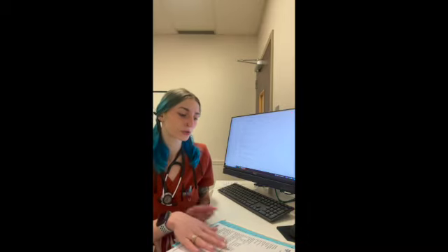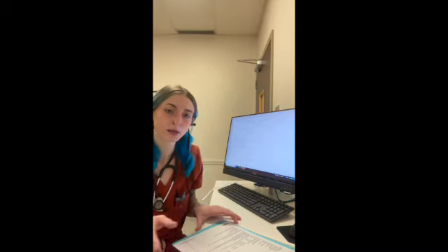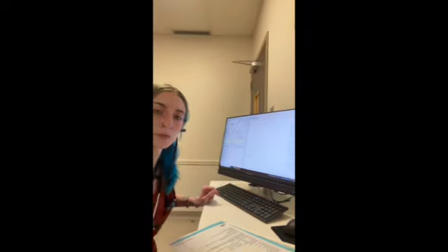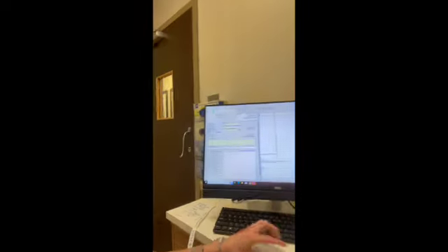In addition to our anesthesia and OR request, we would go ahead and submit our CBC and our chemistry with lytes panel request. So I'm just going to start those and then zoom in on that. This is what our online request form looks like. This is for a chemistry panel. It already has the patient information because it's for this patient's account specifically. The patient information is located here.